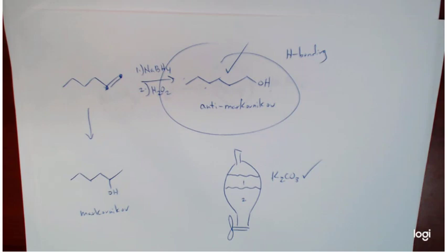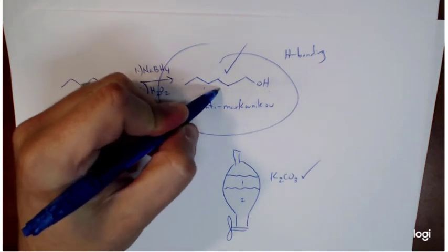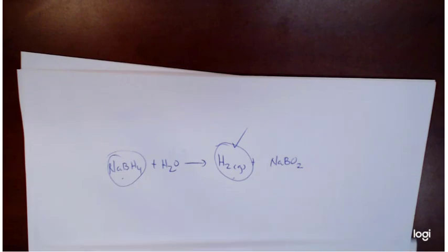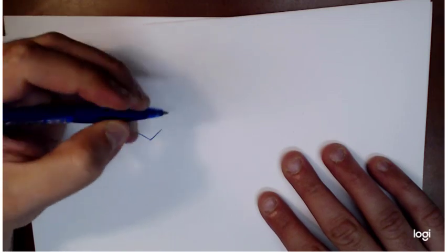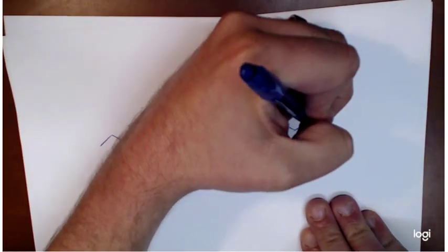And then lastly, some things to be aware of. You would need to evaluate your compound after you isolate it using IR. So thinking about what's happening here, how are you going to determine if your reaction was a success via IR? Well, let's look at our reactant and let's look at our product.